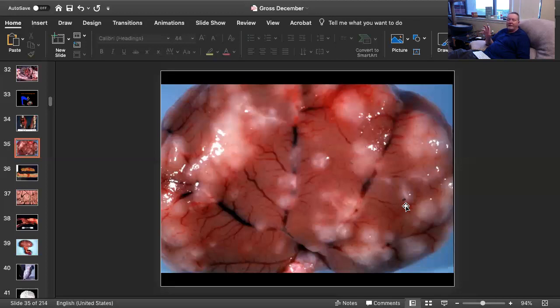All cats have enteric coronavirus, but in certain individuals, and we don't know why, it mutates. And the mutation allows it to live within macrophages. Once it can live within macrophages, it can't be cleared, and that's where the chronic disease of FIP begins. Most parts of the body, it tends to be a vasculitis. In areas of the nervous system, it tends to be more granulomatous inflammation. That would include the retina as well. But this is a great case right here of FIP.